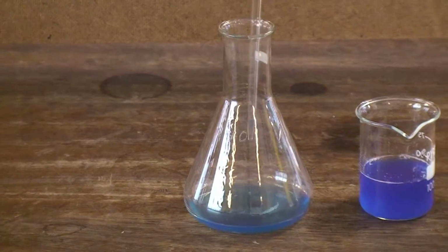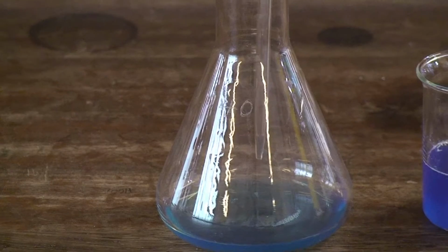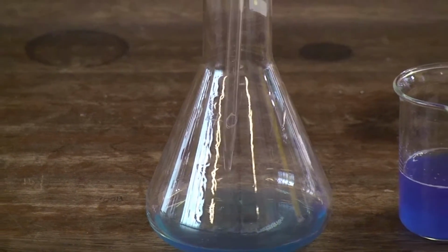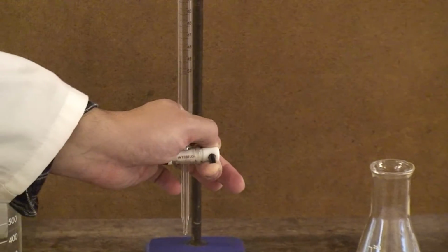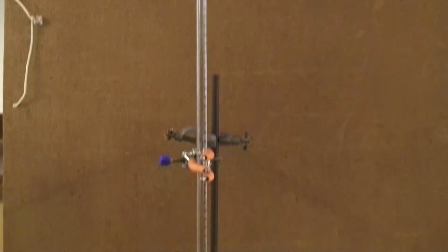When releasing the solution into the conical flask, you want to carefully dab the tip of the pipette onto the surface to ensure that there is no remaining liquid in the pipette. Before you begin the first step of the experiment, make sure that the valve is closed. You then want to put a funnel on top of the burette and a beaker underneath the tip.